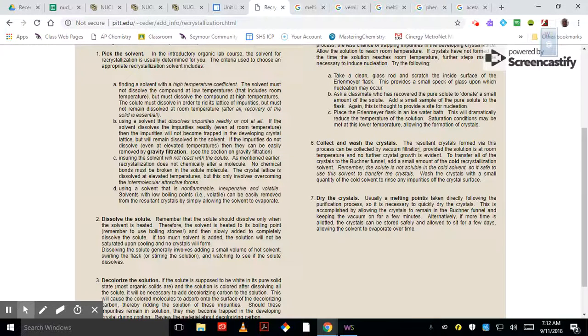Now you take a Buchner funnel and weigh your filter paper, pour it on there and filter it, and then take a little bit of the cold recrystallization solvent. So in another beaker in an ice bath, have some cold solvent ready, and you just want to wash the crystals off with the cold solvent. If anything's left on the crystals after you've pulled them through the Buchner funnel, this will do that. And you can also use a little cold solvent to get some out of the container you were recrystallizing in if they all didn't go in. Then you've got to dry the crystals.